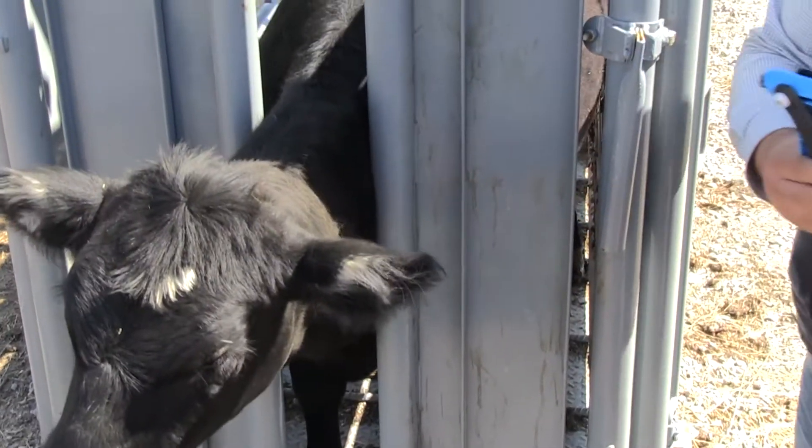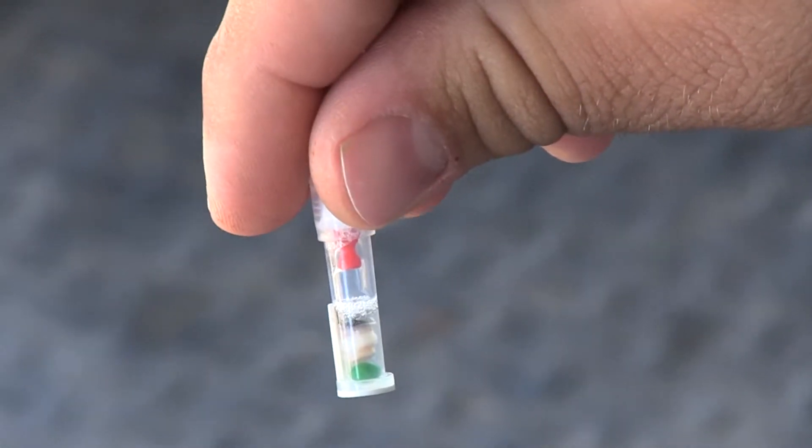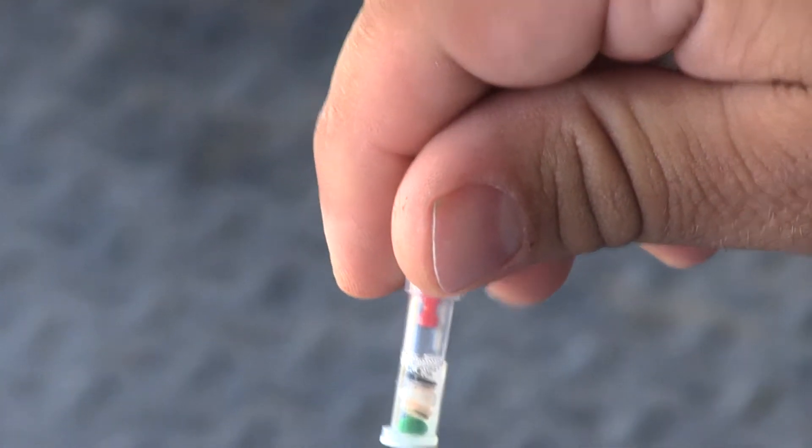We need to take the TSU out of the applicator and confirm that we have a good sample. To do that, you'll look and see two rings of flesh with a ring of cartilage in between, and you'll see that green ball which was the seal before the tissue came into the sampler.